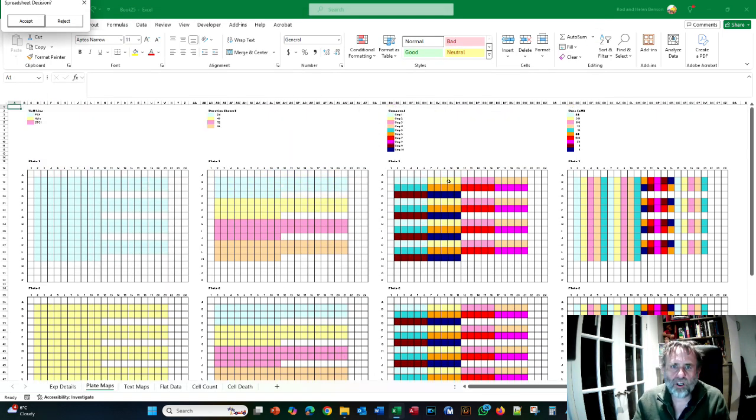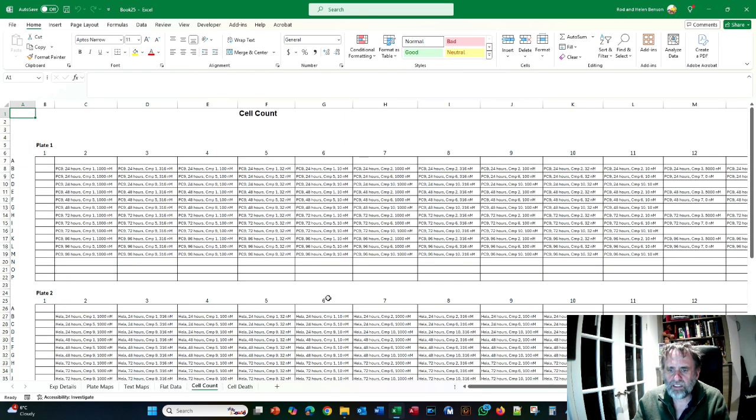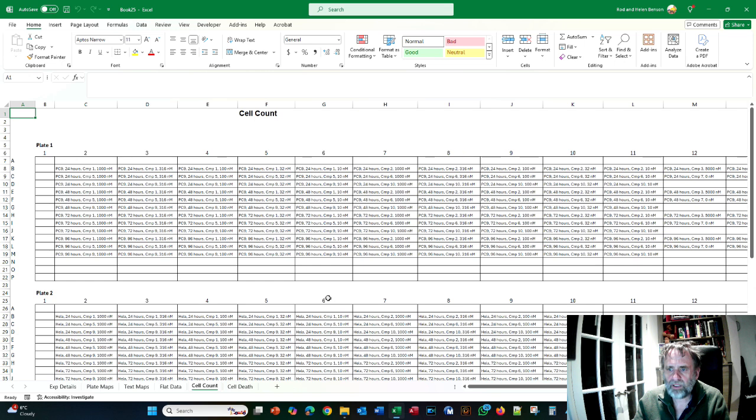So just to finish off, I will now just finally accept this because we finally have the plate maps that we want today. And if I accept it, you'll see that now the workbook is left on the screen. It hasn't been saved, remember, because we didn't ask it to be saved on page 1. And if we look through this, you can see we have the plate maps. There's our flat data table. There's the container worksheets that will receive the data from our plate reading machine with the text version of each sample.